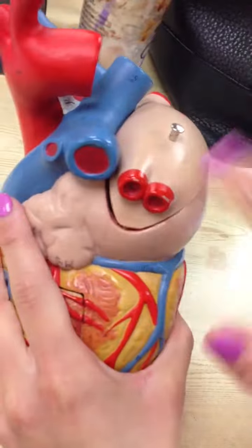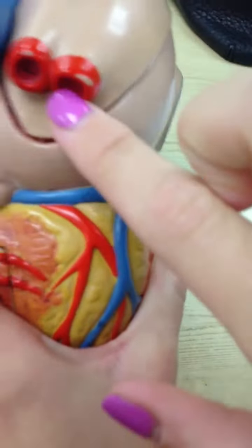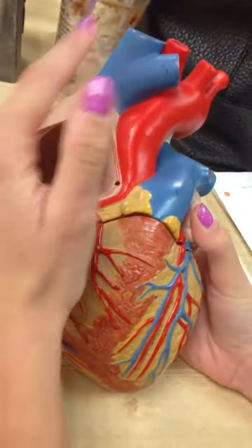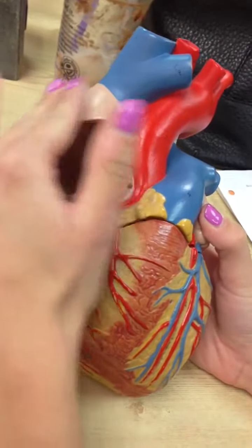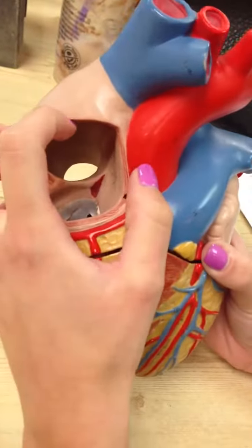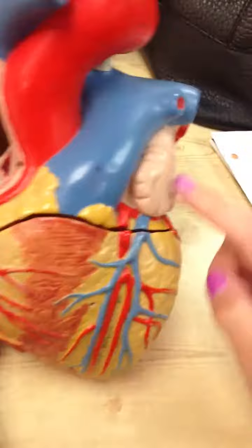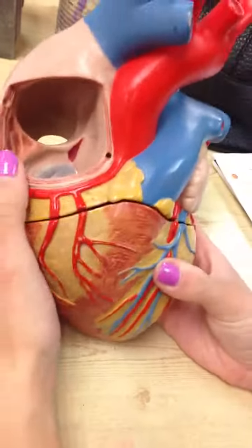Right here are your pulmonary veins. Right here is your right atrium, that's where your right atrium will be. Right here we have a missing part, and that's where the right auricle would be. The left auricle is on this side. The right auricle, or missing portion, is on this side.